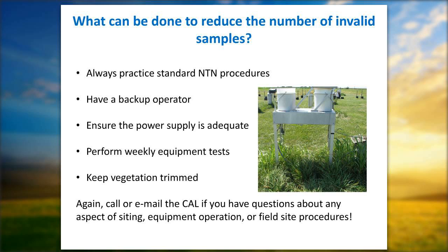Those samples get checked when they get logged in, and we allow a little bit of leakage, I think up to 5 mils. We actually look at what's in the bag, and you'll have a little bit of condensate in there or something. But if it's more than about 5 to 10 mils, we do screen the chemistry, because we've done tests that show that water can leak out of the bottle into the bag, and can also leak back. We've tested that.